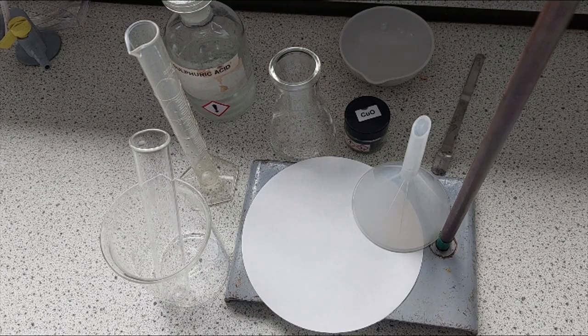Today what we're going to be doing is looking at how we can extract some copper sulfate crystals from a solution. Now what we're going to do is two types of separation technique. The first one is filtration. We're going to look at how that works, and then we'll move on to evaporation and crystallization.